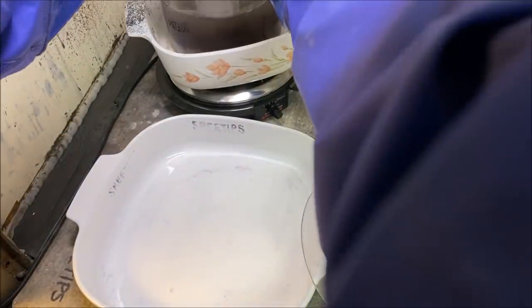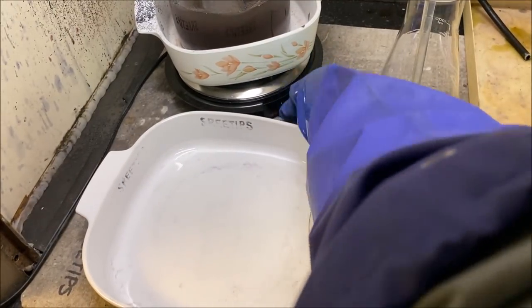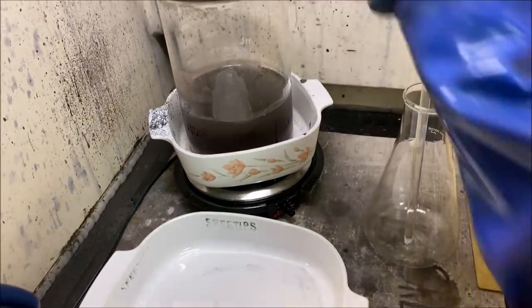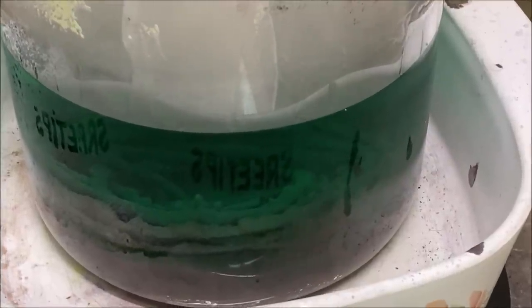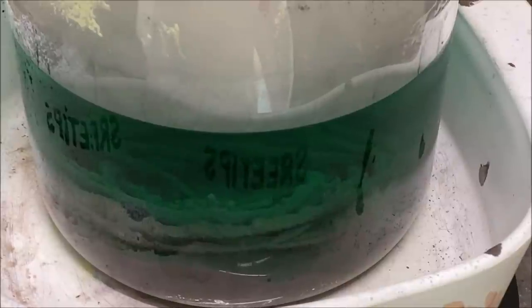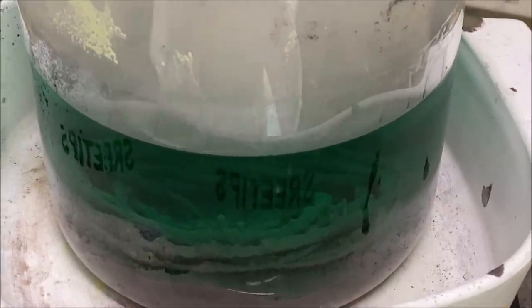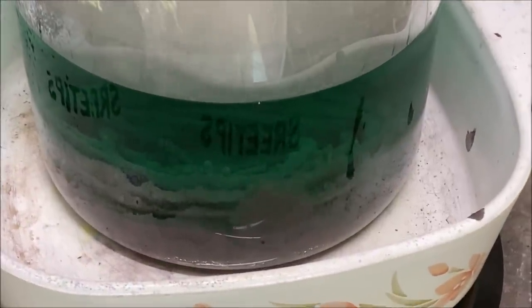Sticking it back on the heat to continue boiling. This has been on boiling today for about 10 hours now. I think I've had it on the heat now in boiling sulfuric acid for 38 hours total, and it's still not fully dissolved.